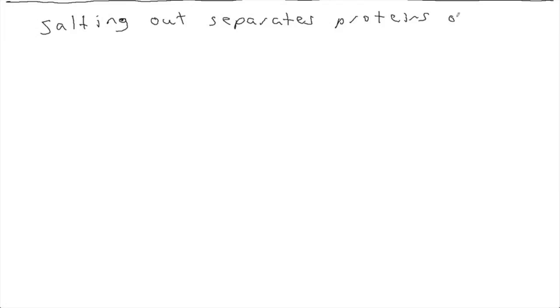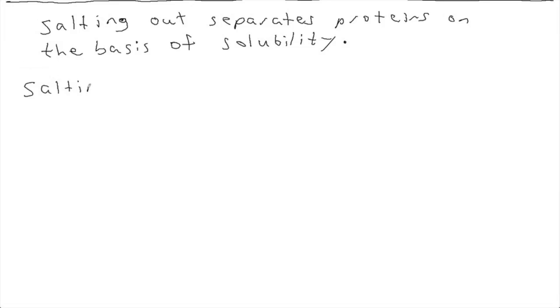So, salting out separates proteins on the basis of solubility. It's confusing because there's actually two different ideas here.